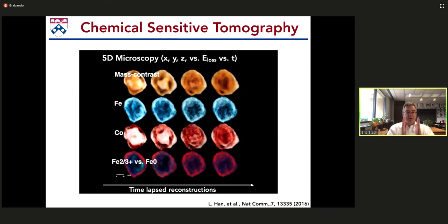So here, a very complex experiment where we went through and took samples. We did tomography. We captured the EELS information point by point at each tomographic step, reconstructed these in 3D, and then tracked this as a function of time in order to understand how these things occurred. And you'll note that the scale bar at the bottom turns out to be 10 nanometers. So this is a relatively large particle for us, something like 30, 40 nanometers. But again, right at the point of what's very challenging for an X-ray.